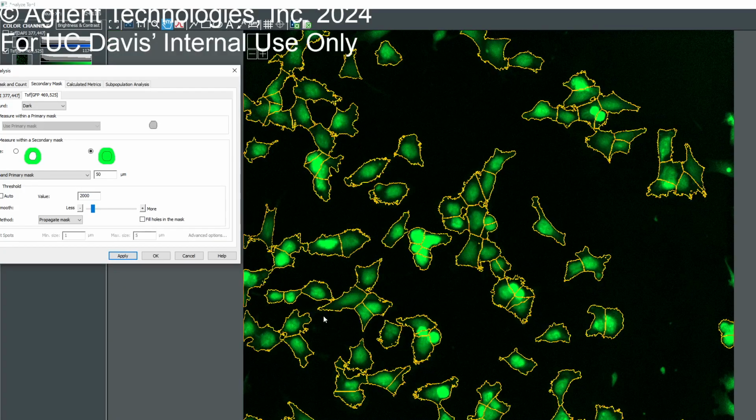That basically tells you that Gen5 can see things we can't. When we set it up, maybe the exposures, gains, and all that, our eyes look a certain way, and the system is a little more visually competent than we are. Exactly. So we never want to overexpose our images. It's always good to underexpose, because if it's overexposed, there's a certain cap, right? The data is going to max out at some point.